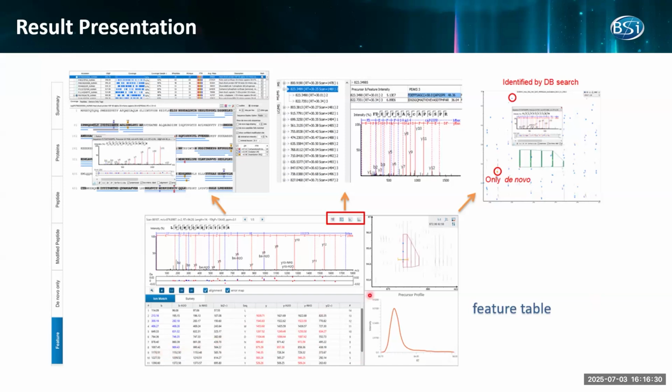We give their MS, like heat map information, and their chromatogram information. If there is a tandem spectrum associated, like in this case where they have an ID, we will show the spectrum. And if this peptide comes from a protein database, you will have protein information associated, showing where it is located, with the supporting peptide.